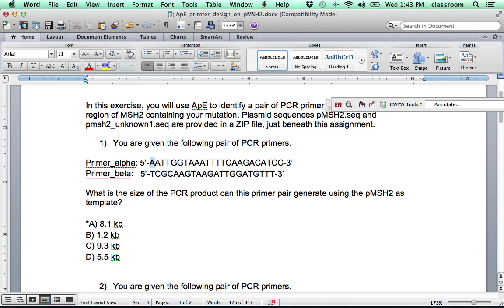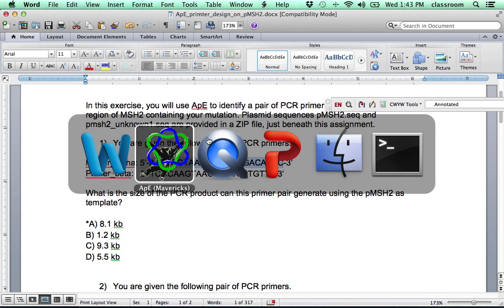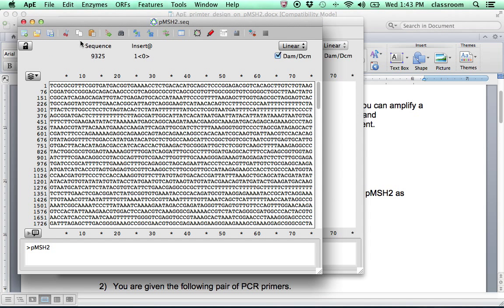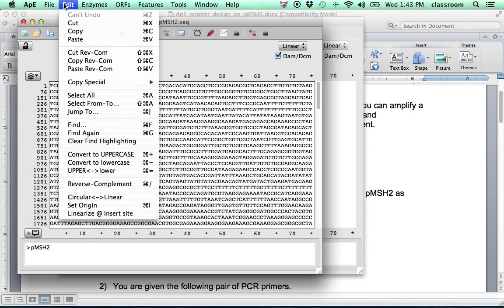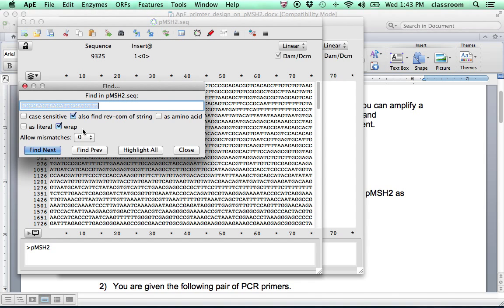So let's first select the sequence and copy it. And you may find this sequence on Moodle. And you just highlight and copy it. And then go to APE. Then go to Edit, Find.